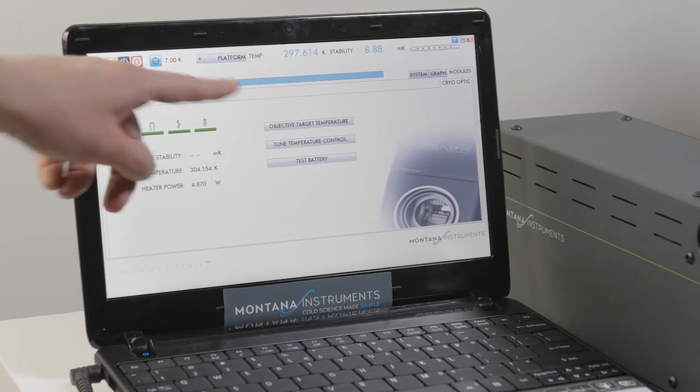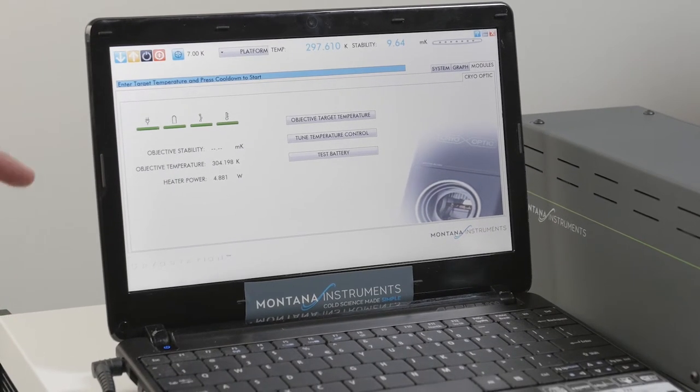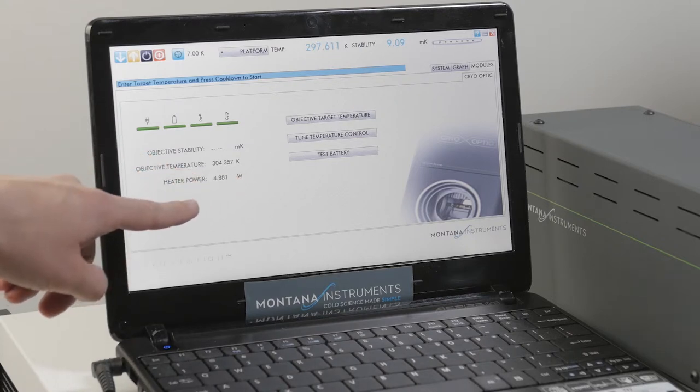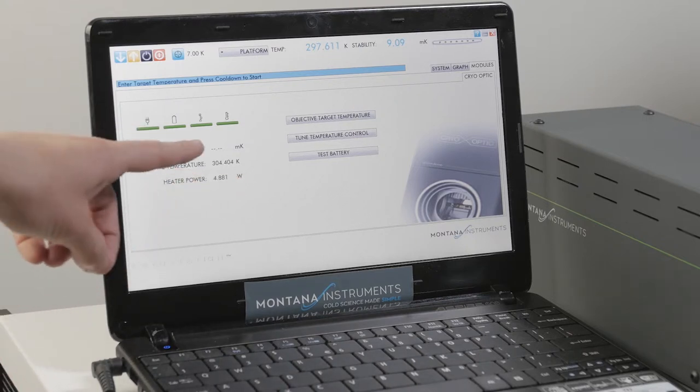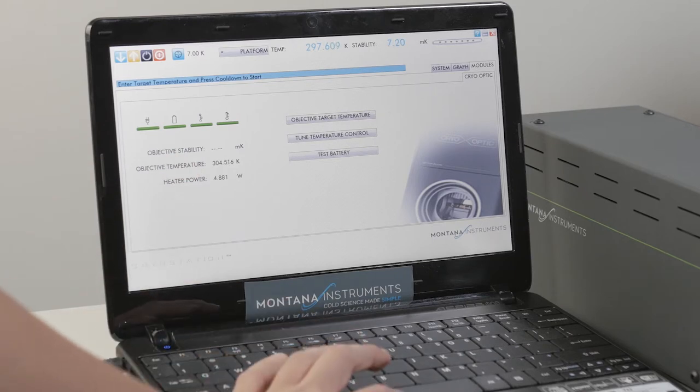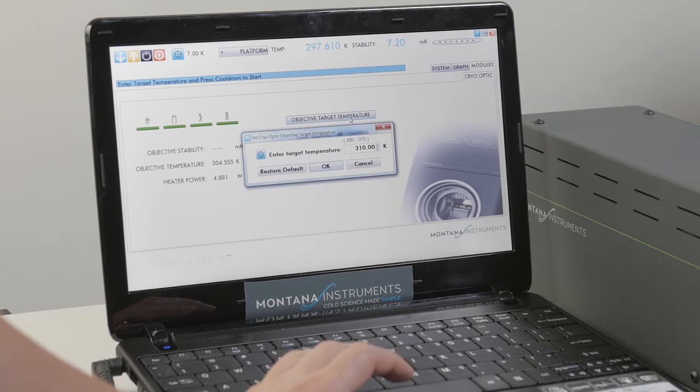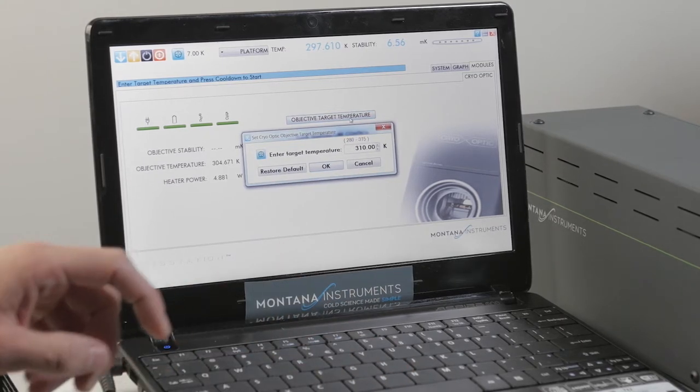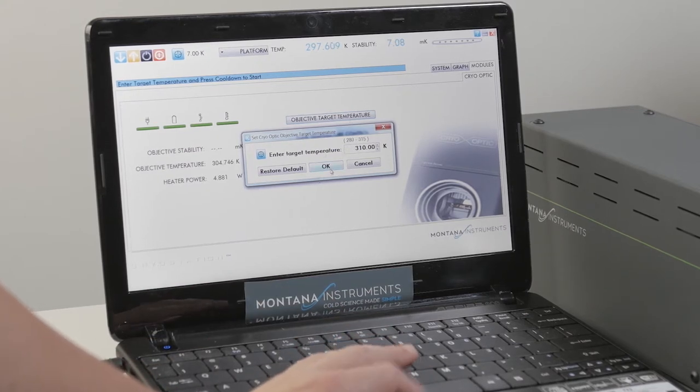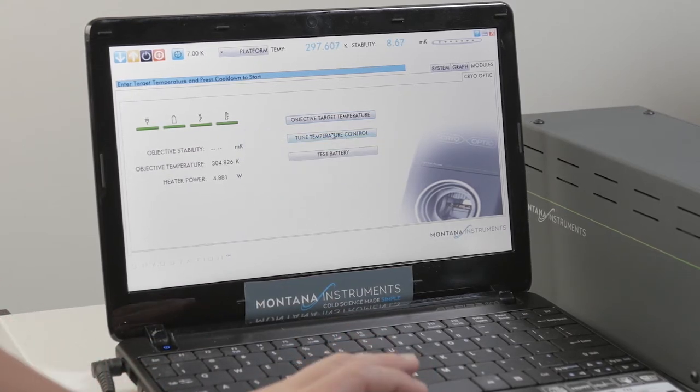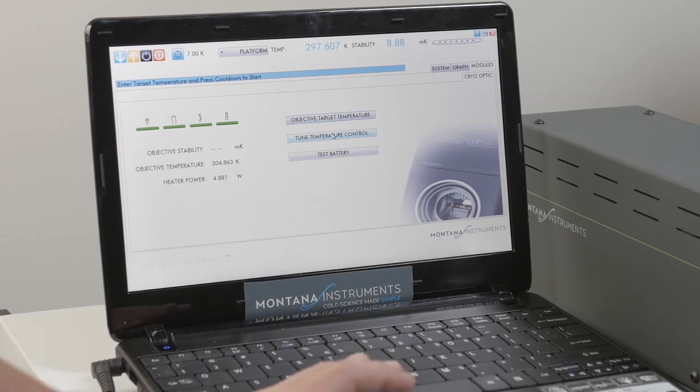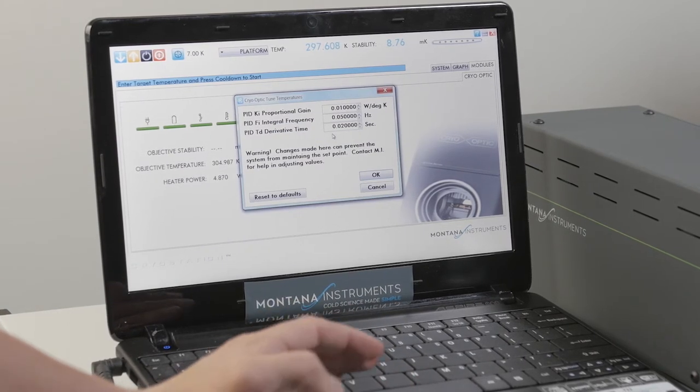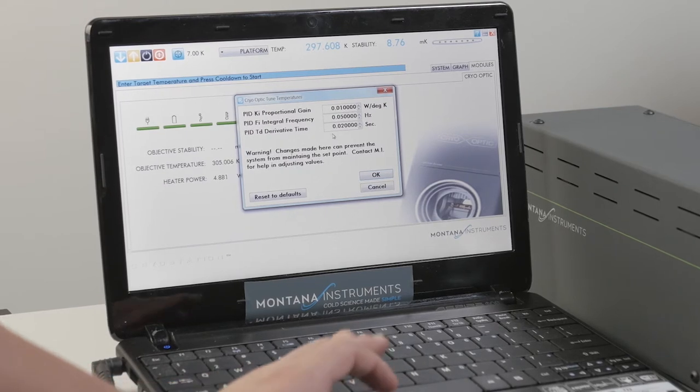The target temperature for the objective is automatically set to 310 Kelvin so here the heater power is almost on full at 5 watts to achieve the 310 Kelvin set point. You can change this from anywhere between 280 Kelvin and 315 Kelvin if you would like. The other option is to tune the temperature control. You can change the PID settings if you would like but since this is operating in a small range you really shouldn't have to do this.